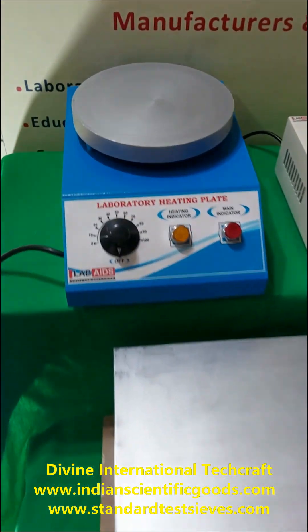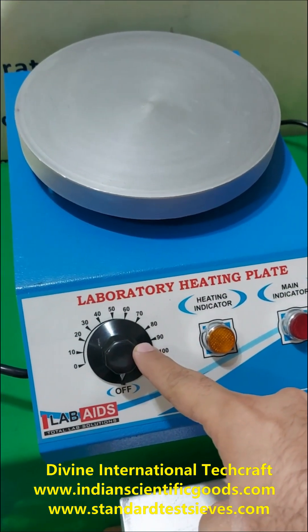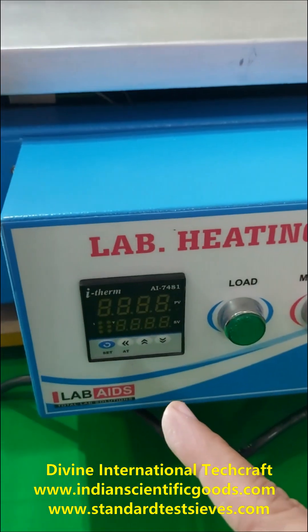Temperature can be varied from ambient to 370 degrees using an energy regulator, thermostat, or a digital temperature controller.